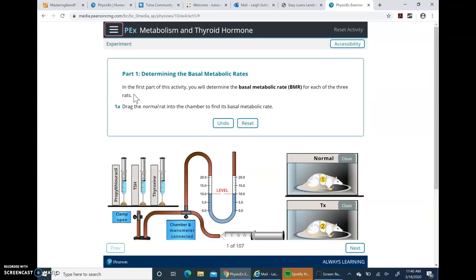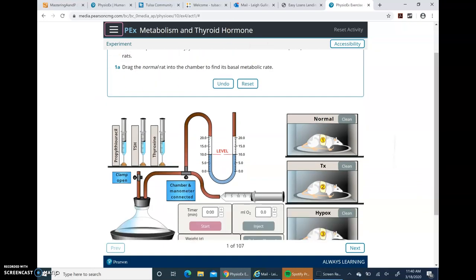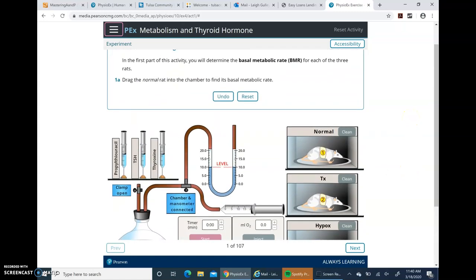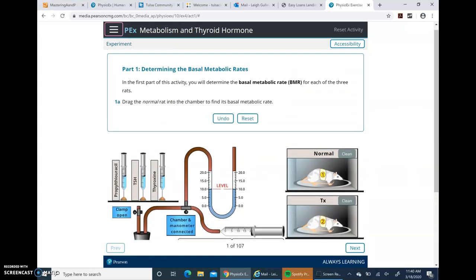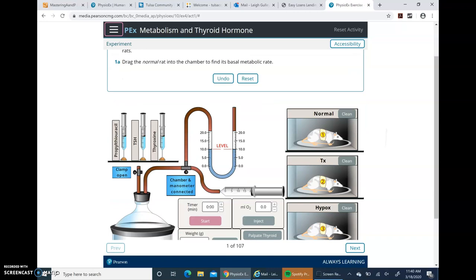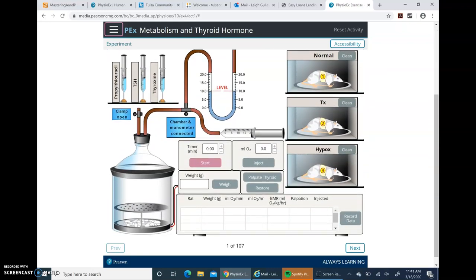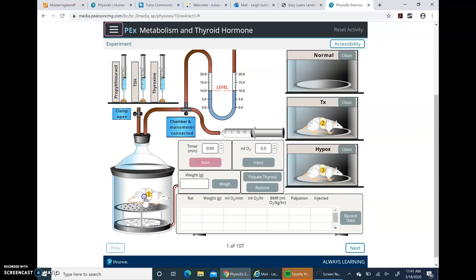You have to read the instructions in this box, complete the instructions, and then click Next at the bottom of the page once you've completed it. What we're going to be doing here is determine the basal metabolic rate for each of these three rats on the right-hand side. Go ahead and drag the normal rat into the chamber. You take your mouse, drag the rat to the chamber, and then click Next.